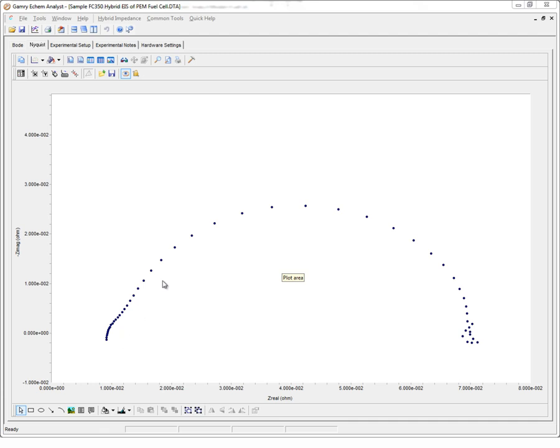Here are Hybrid EIS data of a PEM fuel cell acquired using our FC350 fuel cell impedance monitor. This data file is included as a sample within Echem Analyst.